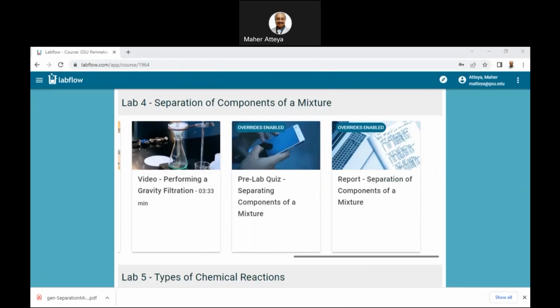Hit copy. Go back to our, take this one out. It's too large. Better make it smaller. Yes, that's much smaller. We click on this icon below.